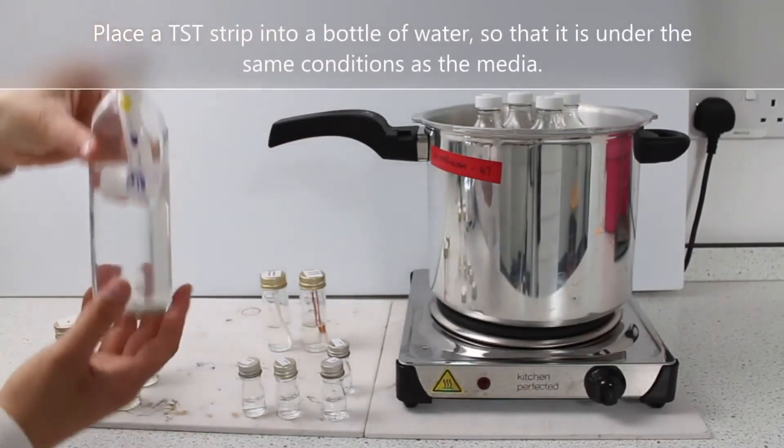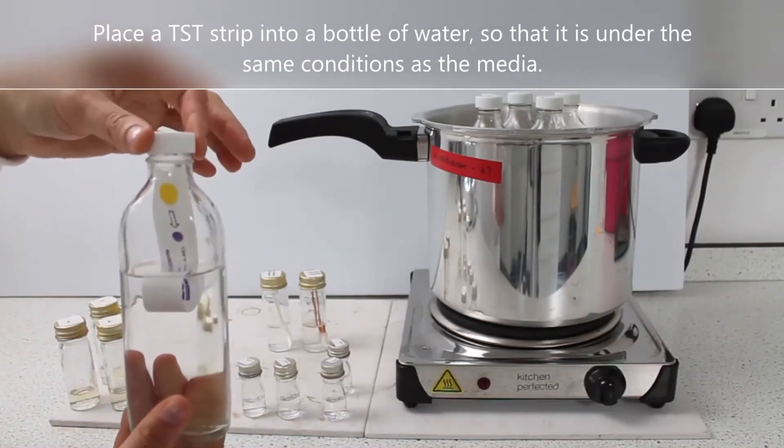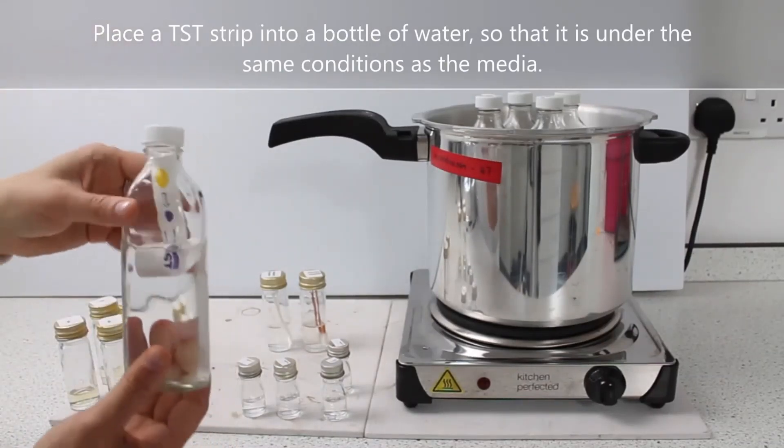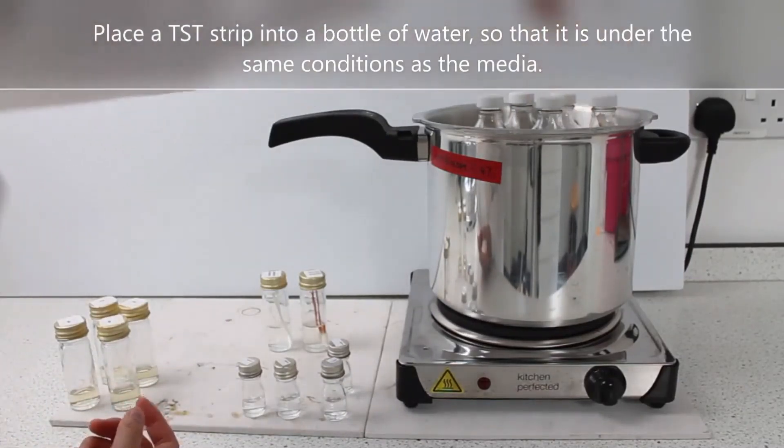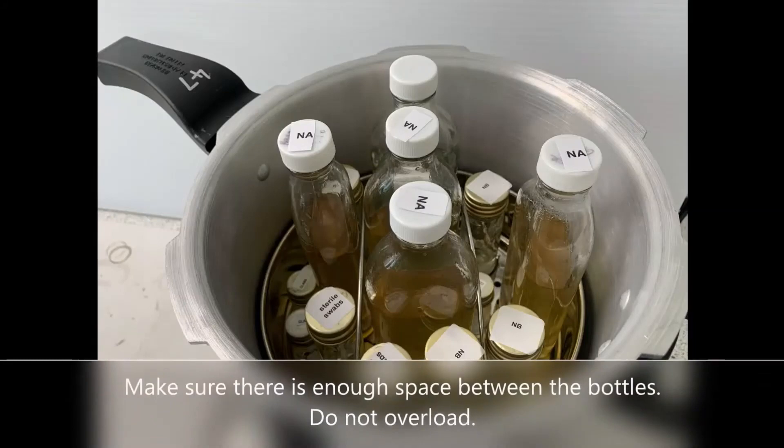Place the TST strip into a bottle of water so that it is under the same conditions as the media. Make sure there is enough space between the bottles. Do not overload.